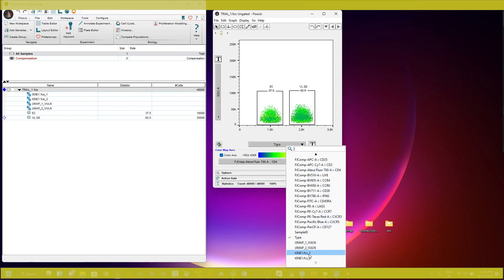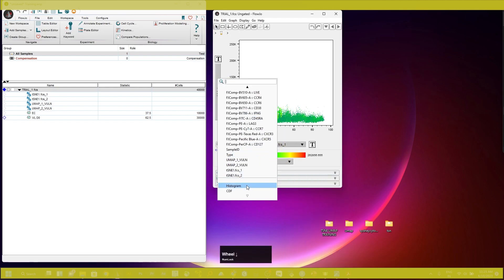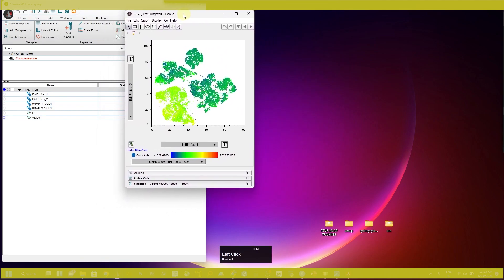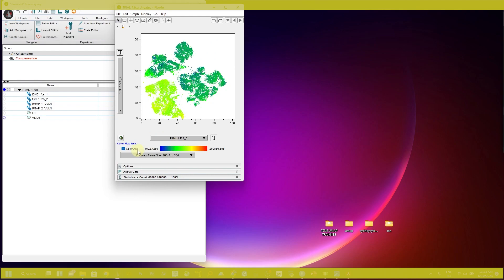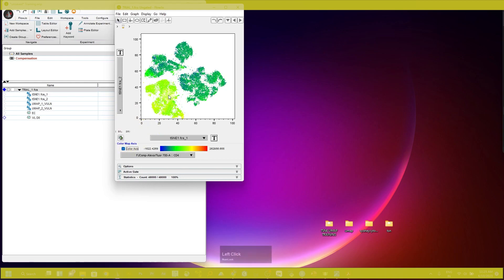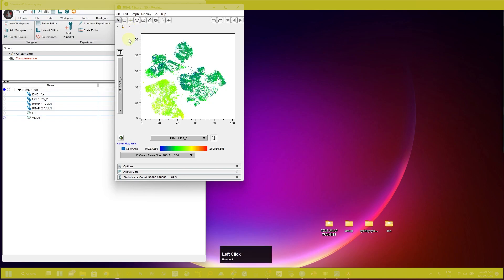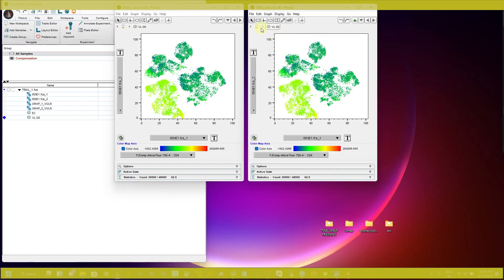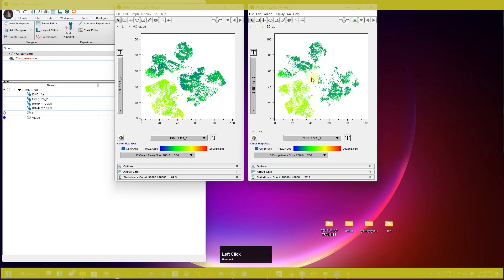If you change the axis — t-SNE 1 on the x-axis and t-SNE 2 on the y-axis — you can see the t-SNE plot. If you want to see the expression of any particular marker, just click here and you can see the expression of CD4 on the total sample. If you change the sample to VLD0, you can see the expression on VLD0, and if you duplicate, you can see the expression on the EC group as well.